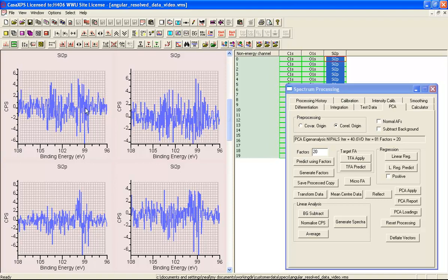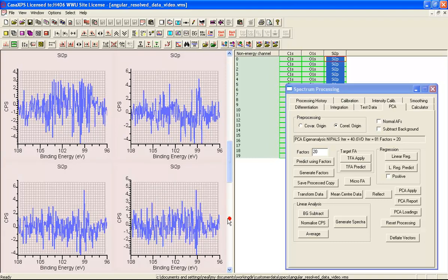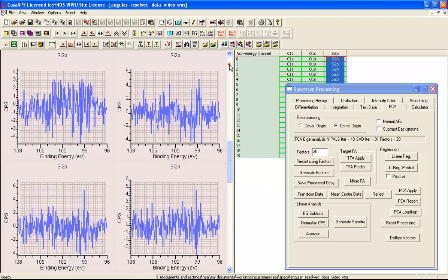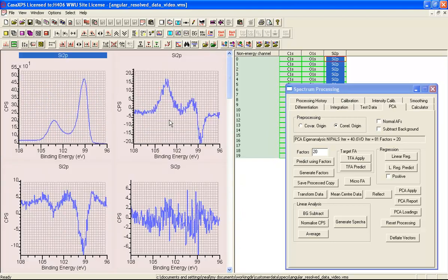So wherever there was a peak, you see an increase in intensity, and in the background you see smaller variations, and this is consistent with what you'd expect for pulse counted data. And the other abstract factors are continuing to show similar sorts of limited variation. So as we scan through all of these, you can see that they are very much in the image of noise from Poisson type data. So we'll go here with 4 abstract factors representing the information in this data set.